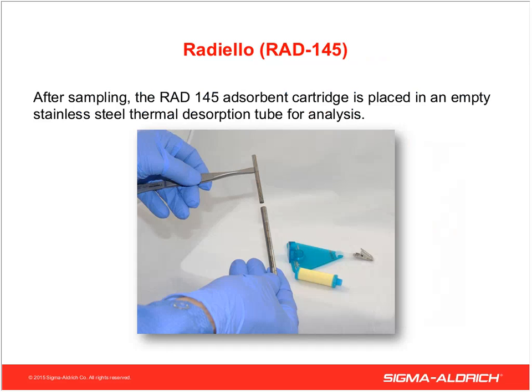So this photo shows how the adsorbent cartridge from the Radiello 145 is removed from the sampler and placed into an empty, clean stainless steel thermal desorption tube to be analyzed.